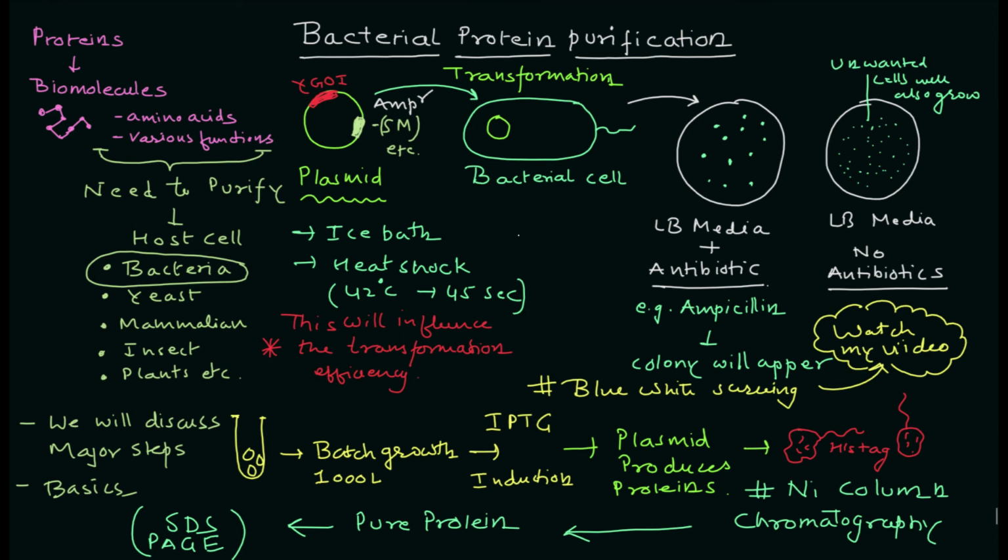So I think this is important. If you understand how to purify proteins, even with the bacterial cell, you should know how to express and purify the protein in yeast, mammalian, and insect cells, and that's the core molecular biology. So I hope that this video was helpful for you to understand the bacterial protein purification and expression part.